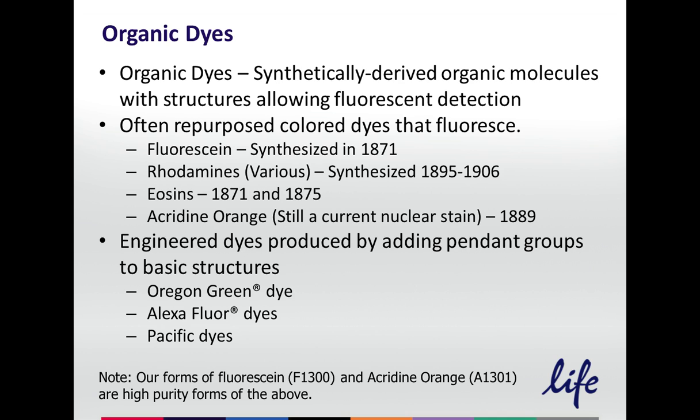Another offspring of this attempt to make synthetic quinine were some of the first fluorescent dyes used to treat trypanosomes, for instance. And in the first fluorescent microscopes, they looked at these treated trypanosomes and saw fluorescence in the nuclei. That was acridine dyes, some of the predecessors to acridine orange, a nucleic acid stain, which has an orange color. So it's an interesting tie-in with malaria there, with the history of dyes.